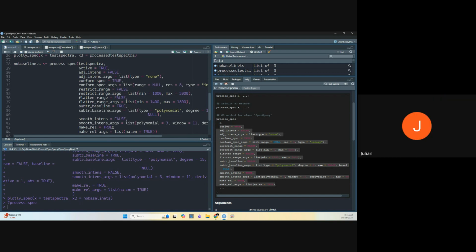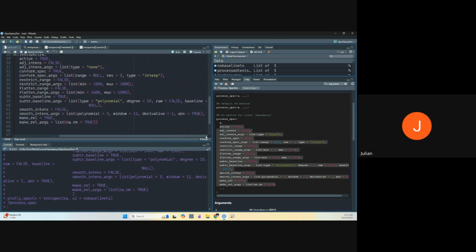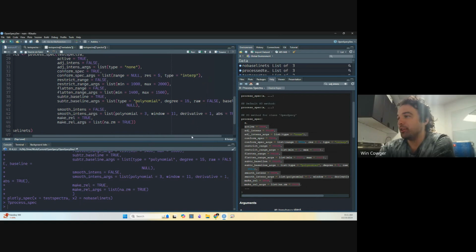Maybe in the same way, I had that question that was hanging over with respect to the degree of the polynomial. The default seemed to not be enough. So I wondered, was it a good default? And should we have a default of 15? Yeah, it's a good question.